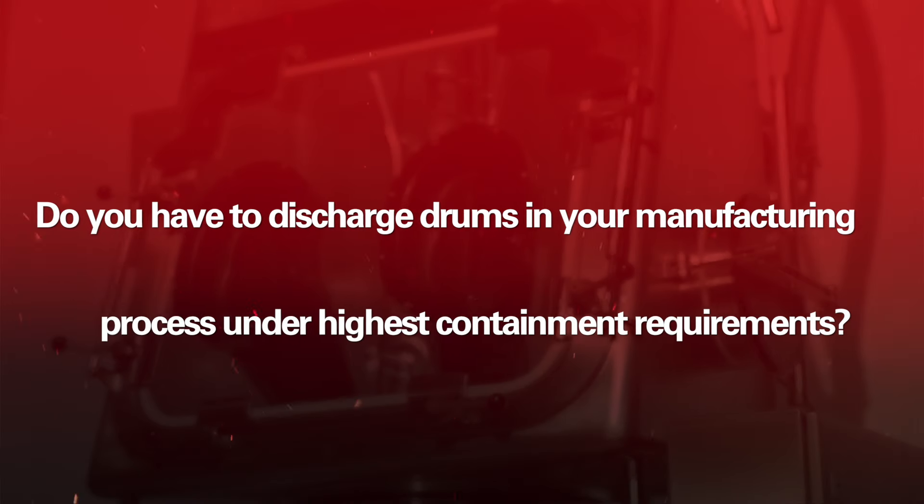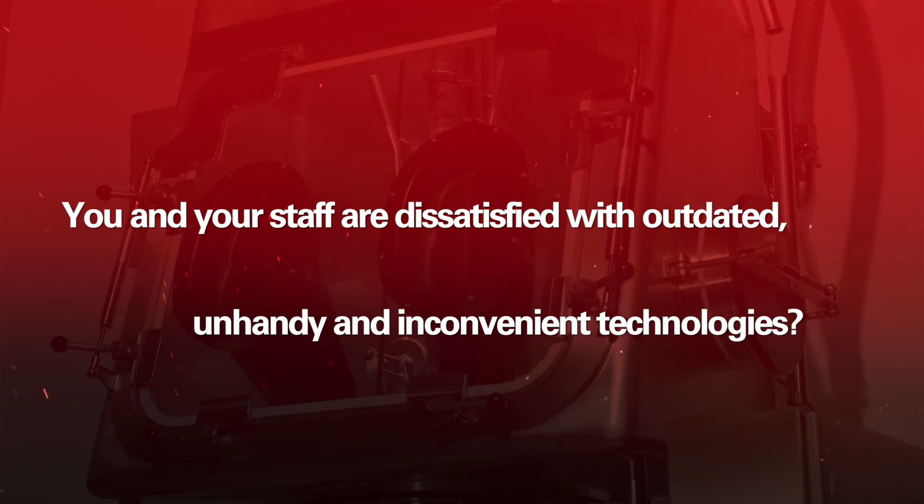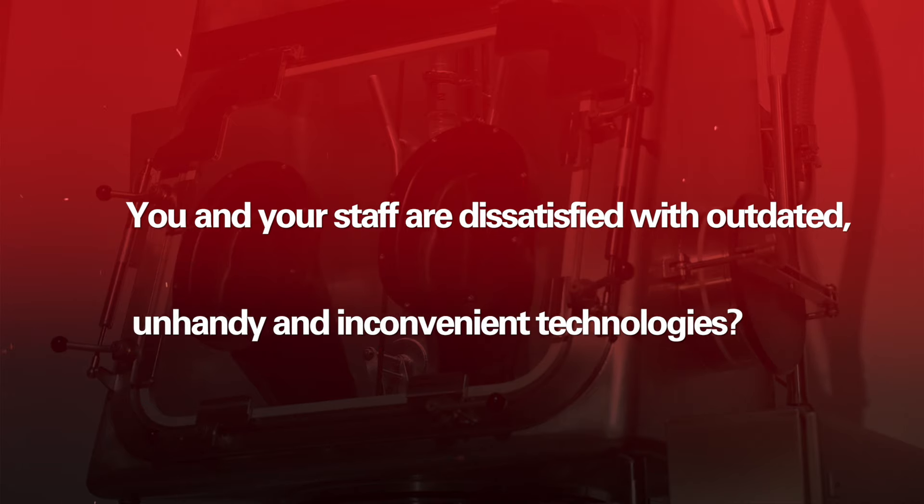Do you have to discharge drums in your manufacturing process under the highest containment requirements? You and your staff are dissatisfied with outdated, unhandy and inconvenient technologies.